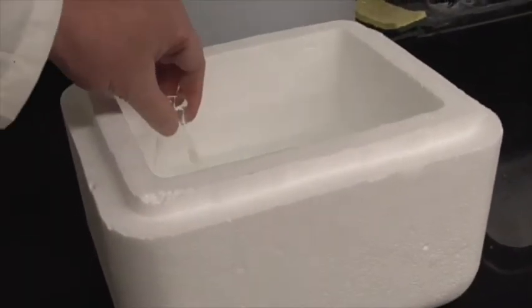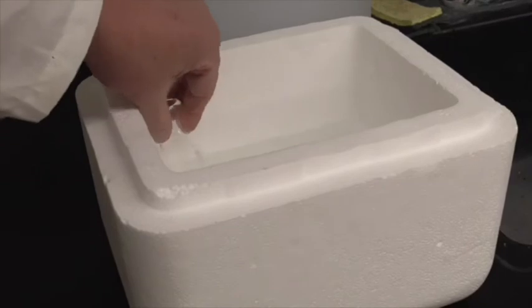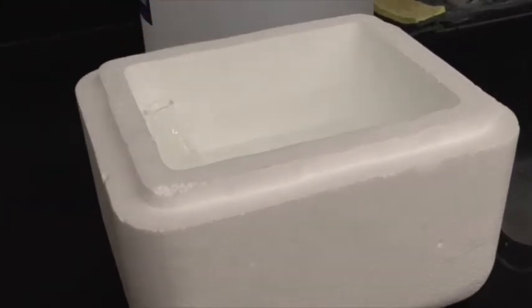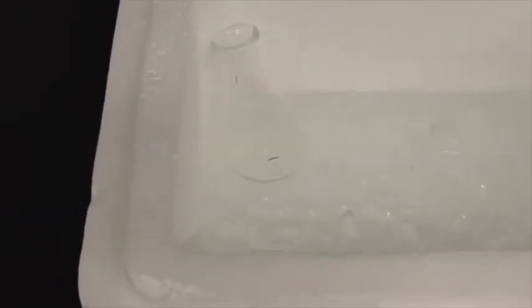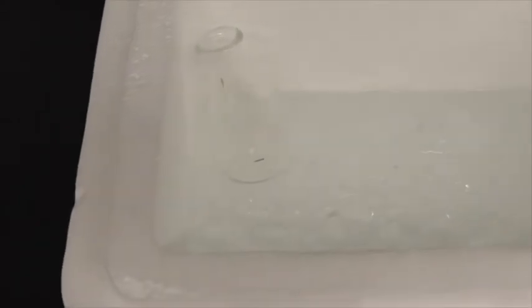So there's our ice bath. I'm just going to put it in the ice bath and just let it cool for the time being. You can see it's just sitting in some ice water there, and we should get a lot more crystals as it cools off. Pull it back out. So we're just going to let it sit in there for 10-15 minutes, and we'll come back and check on it.